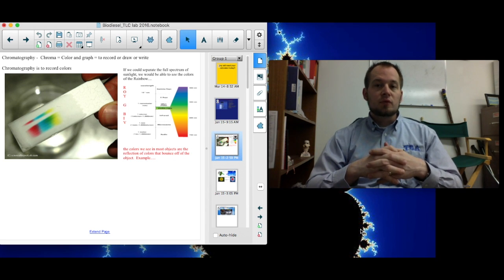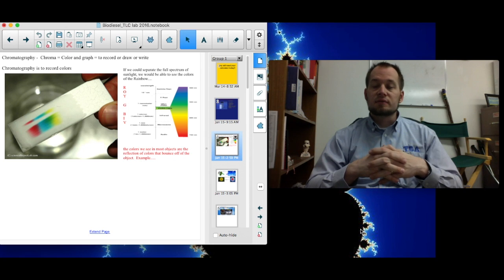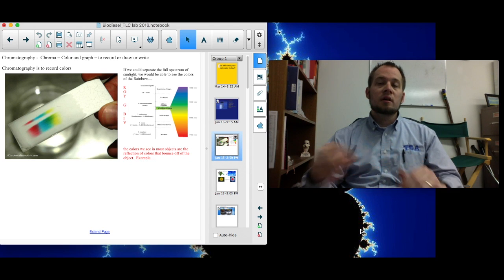It's very useful for determining if a substance is pure, or to determine if a substance is actually even what you think it is, without having to use up a lot of it, or burn it up, or do a lot of complicated tests. It's a very simple test, and it usually shows pretty clearly if you've made what you think you've made. On this slide, you can see the idea of where you would separate out colors using this procedure. In this case, you get the red, the blue, the green, and the yellow, much like a rainbow.